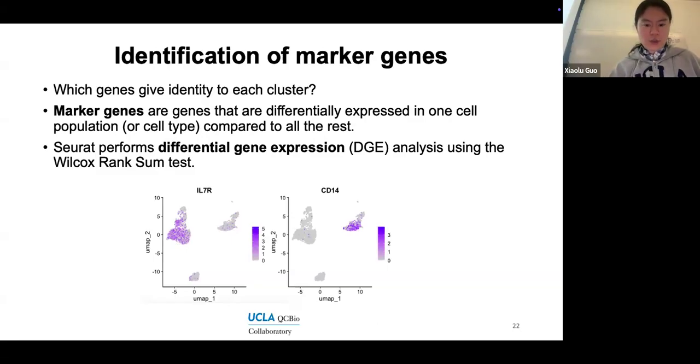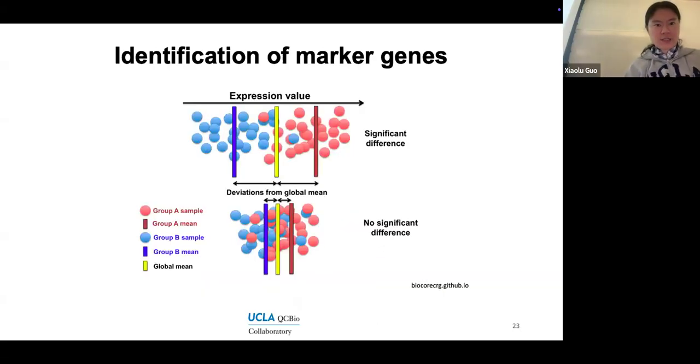I also want to highlight how we define a significantly different expression. Here are two examples, where blue is one group and red is another group.